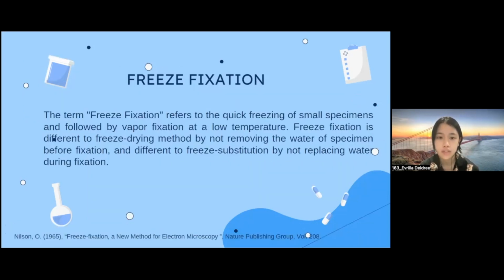Freeze fixation refers to the quick freezing of small specimens, followed by vapor fixation at a low temperature. Freeze fixation is different from the freeze drying method by not removing the water of the specimen before fixation, and different from freeze substitution by not replacing water during fixation.